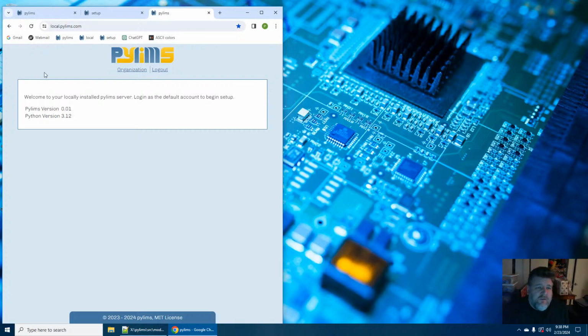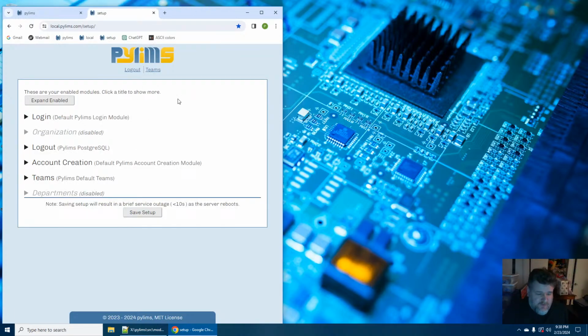And yeah, sorry, tired. Let me get into some of the features. The first thing that I will show you is the setup page. Actually, I'll refresh it. It's a little old. So the setup page works on, you have your modules.